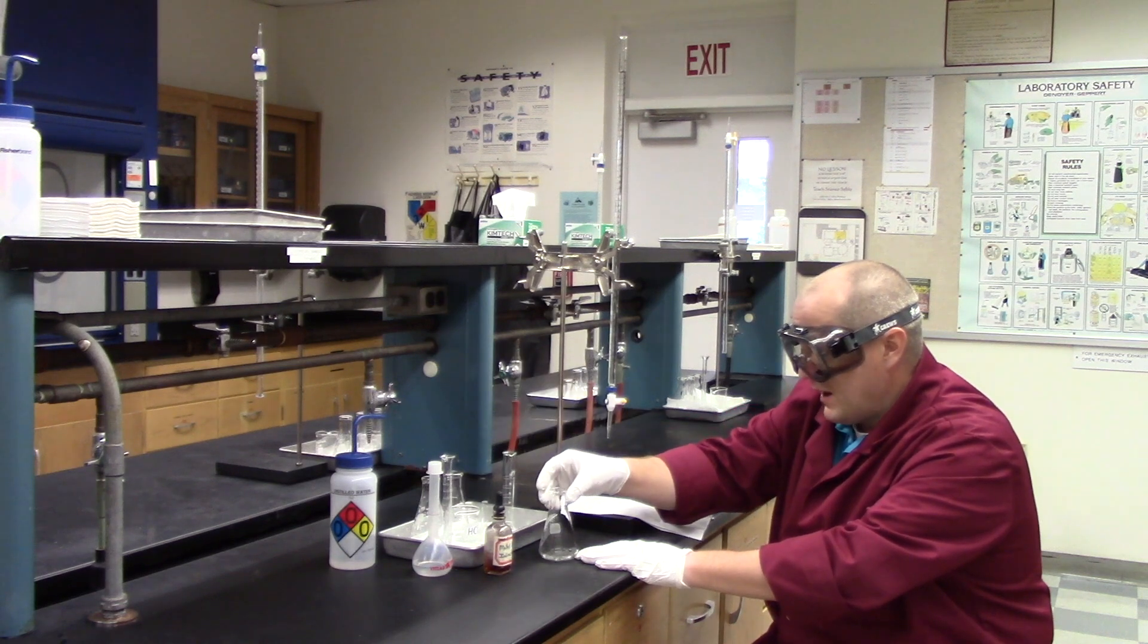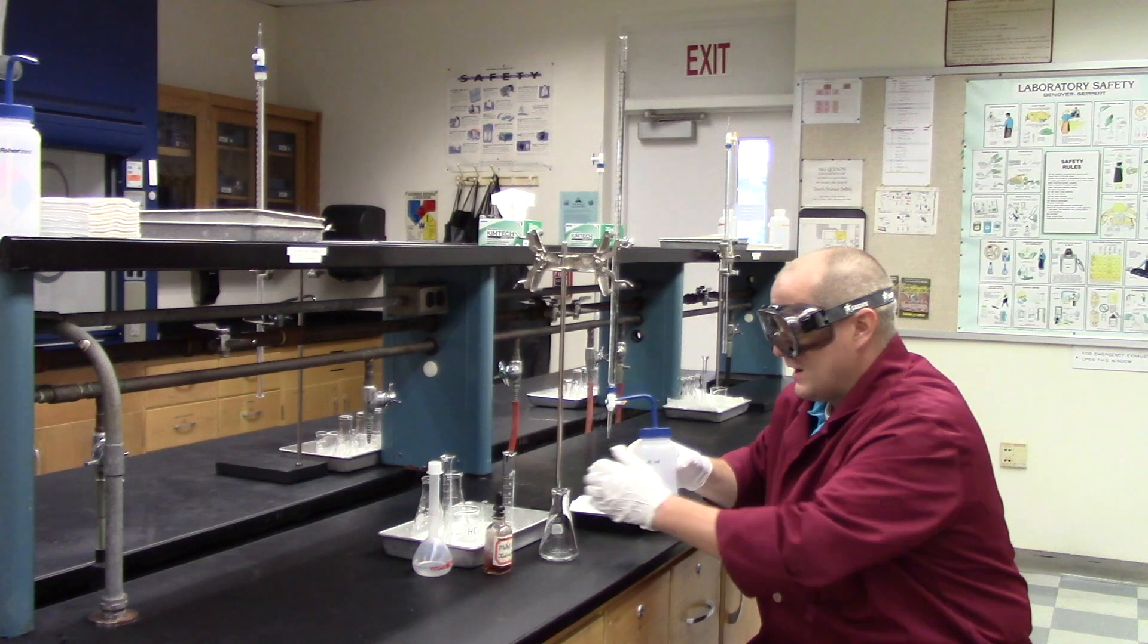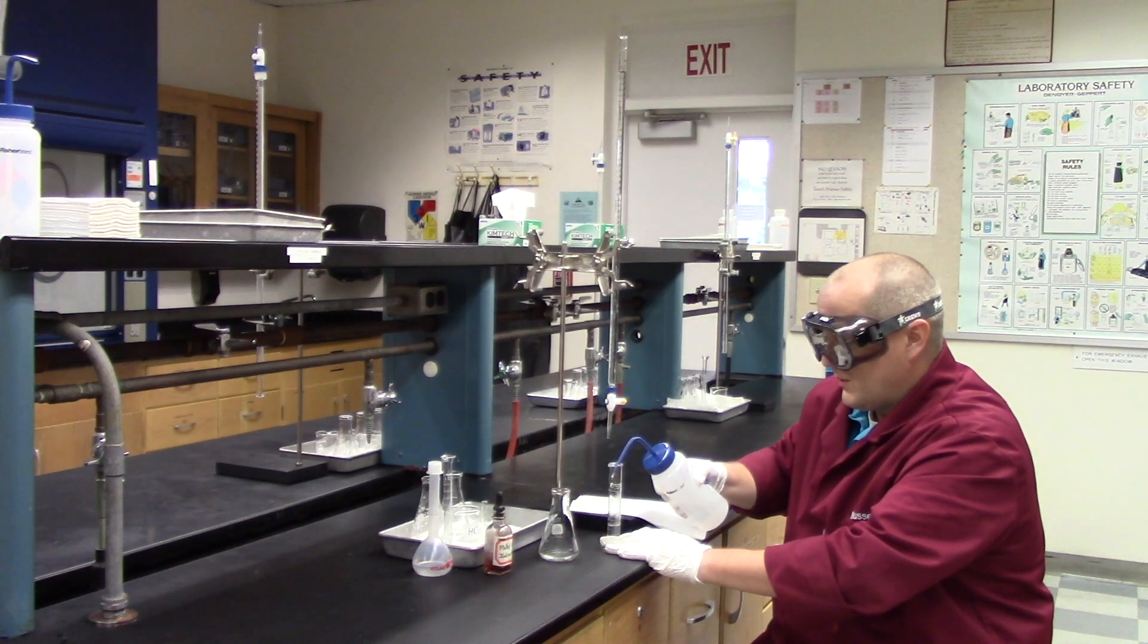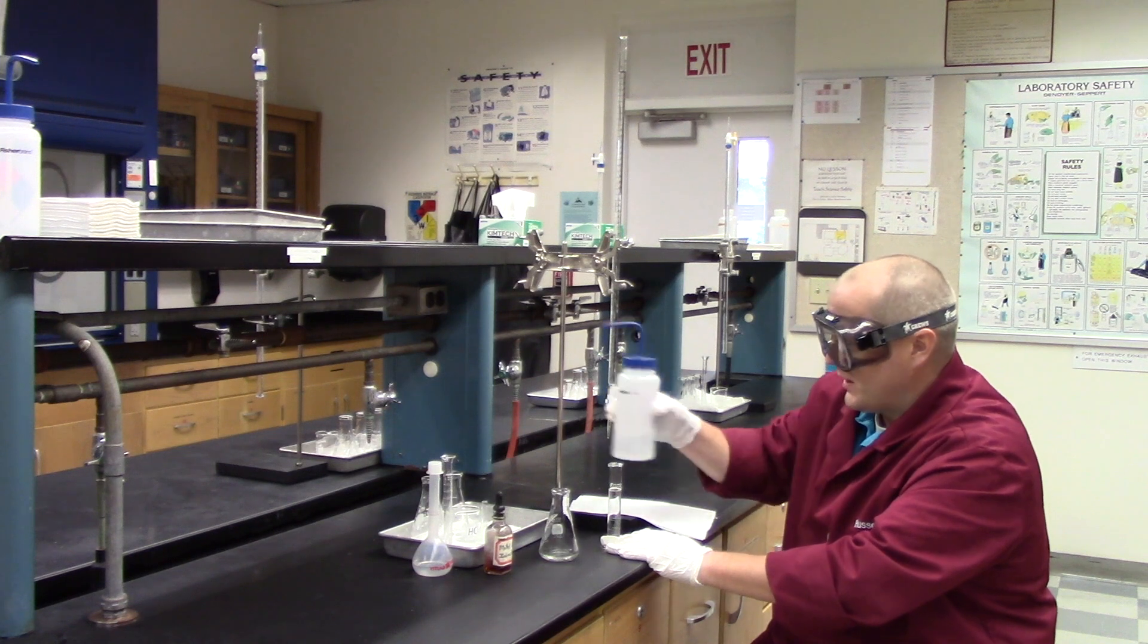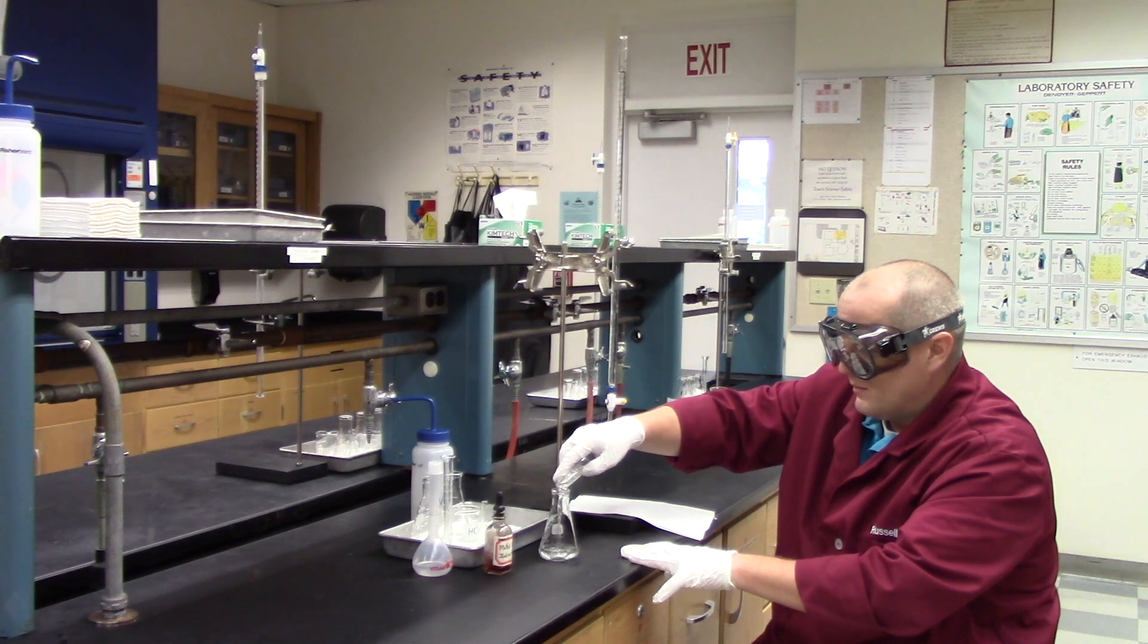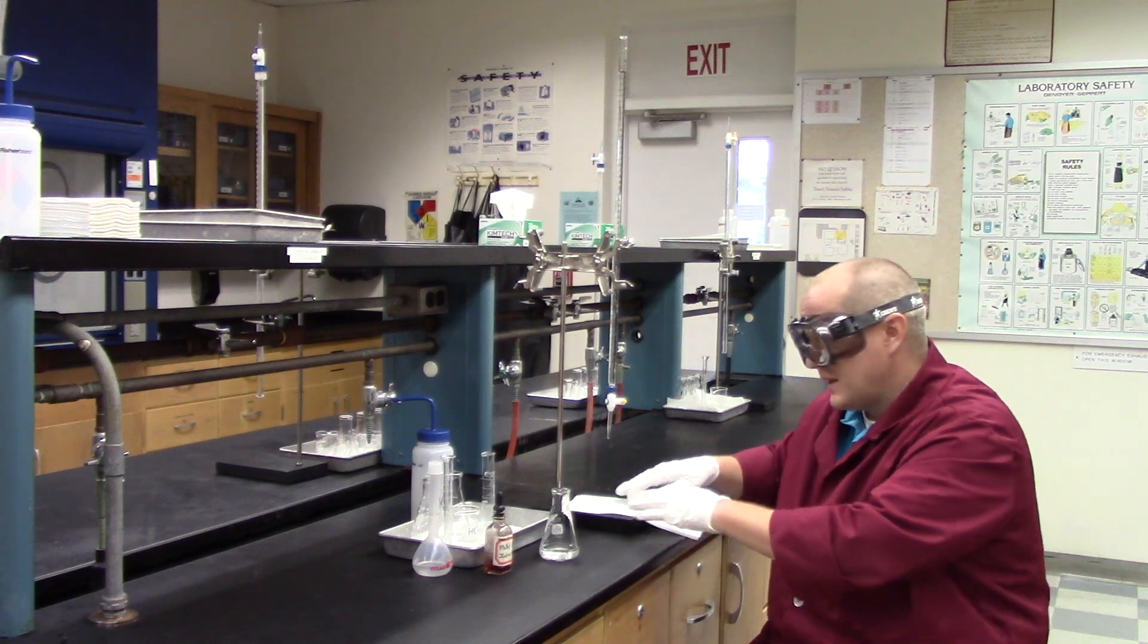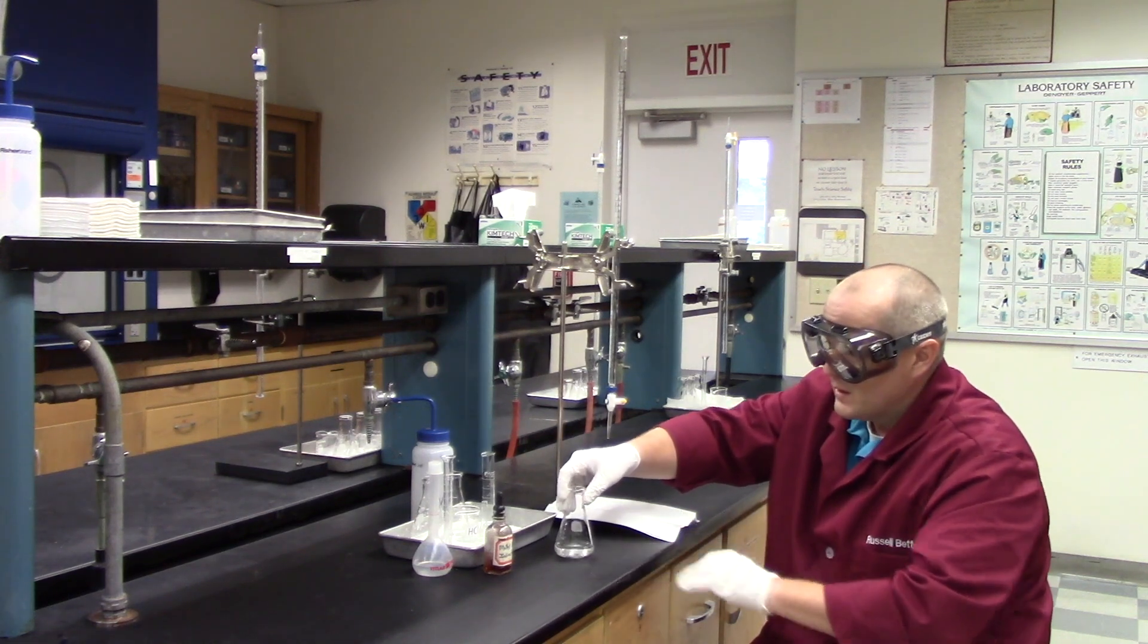Now into this Erlenmeyer that I've placed the 10 milliliters of HCl, I take a 25 mL graduated cylinder, fill it with water, and I add it to the 10 mLs of acid. This 25 mLs of water is not critical if it's exactly 25 mLs. What it's doing is it's simply adding some bulk to our titration so that we can more easily see the color changes. It will be much easier to see because there's just simply more liquid here.